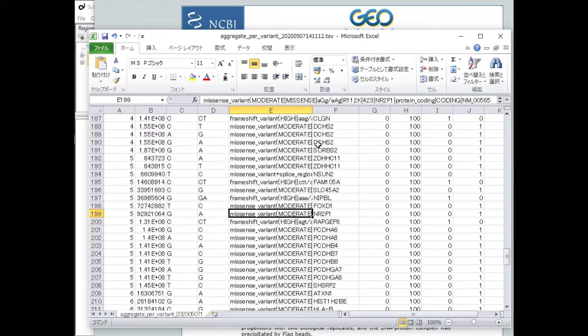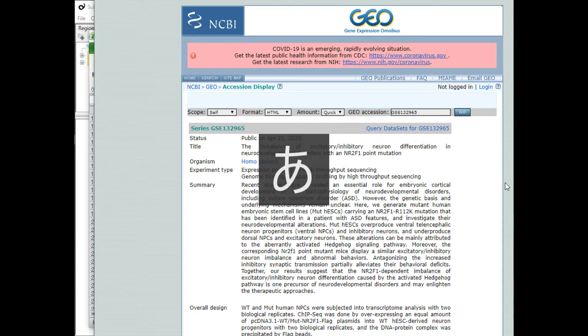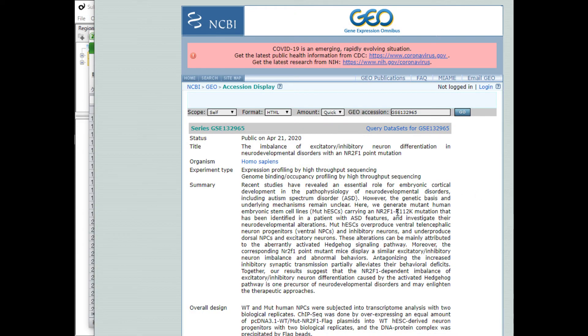Furthermore, the info of NR2F1 gene tells that R112K mutation is correctly detected.